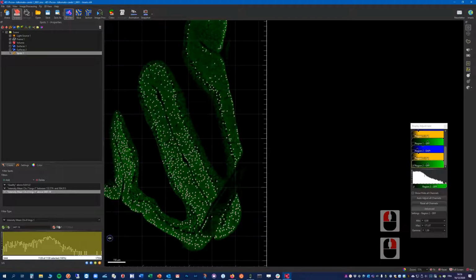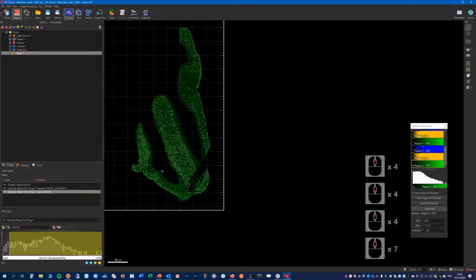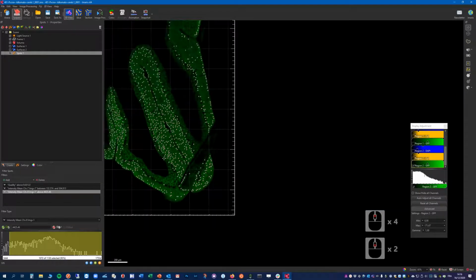Yep. So I think with the combination of those two filters, we can eliminate the spots which are really weak in yellow and which are really strong in blue. So we keep only the spots that we are interested in. We don't want to be too restrictive here at this point, because we will classify the spots we have left afterwards, and we can also have a filter step kind of at this time.